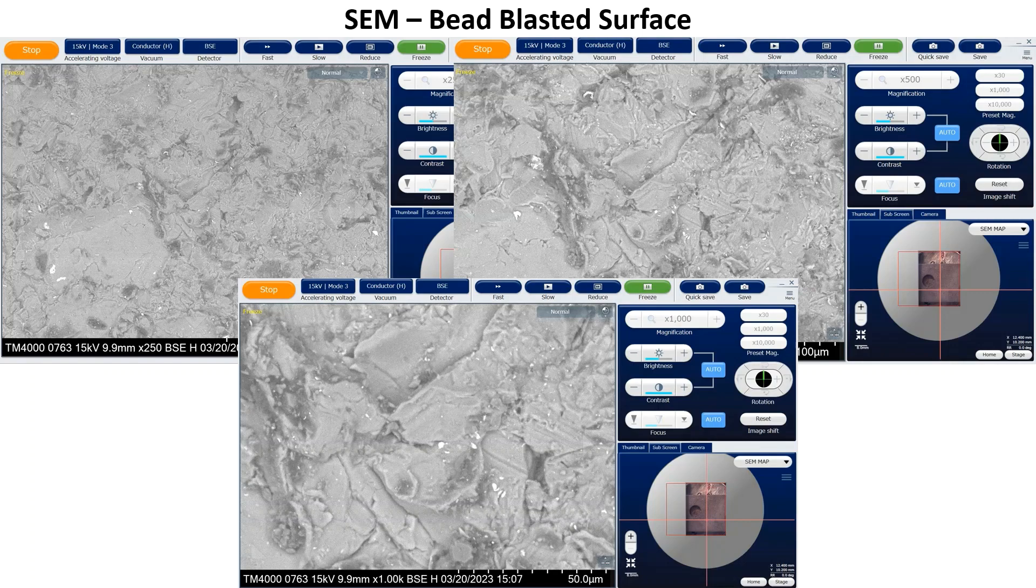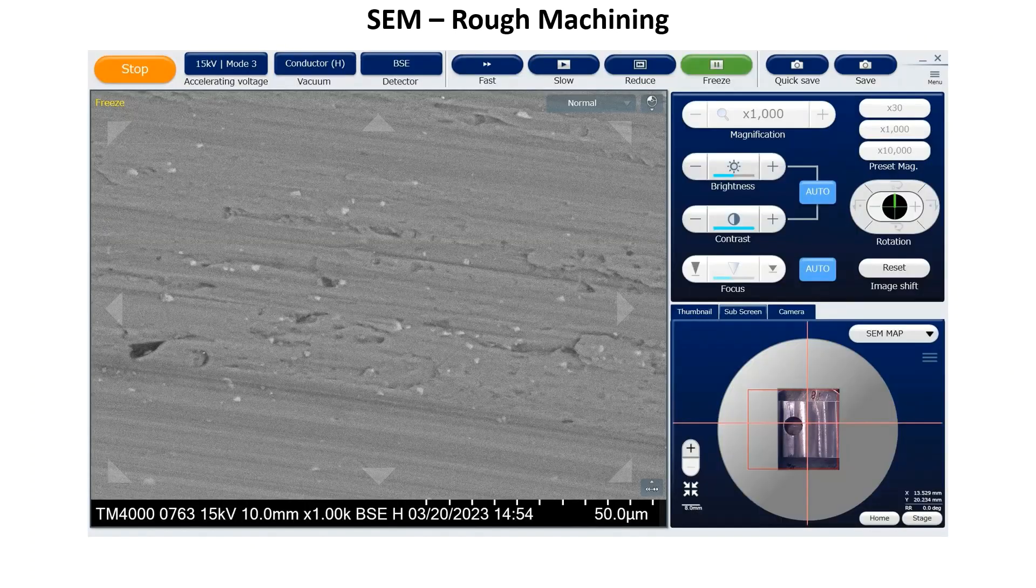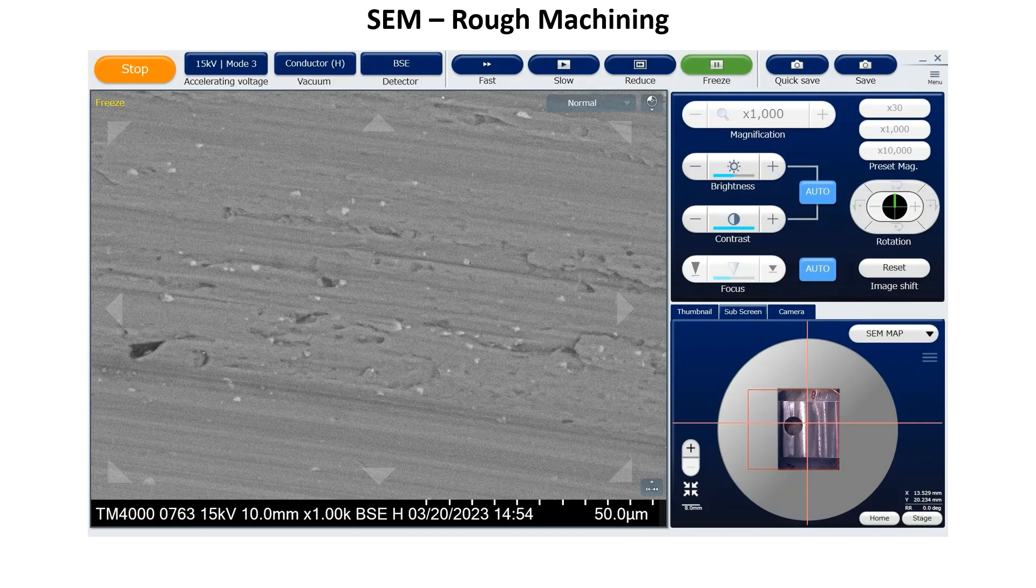This is the bead blasted surface at 250 times magnification in the top left, 500 times on the top right, and a thousand times magnification on the bottom. I was pretty surprised with the roughness and topography of it once I zoomed in. It is even more striking when compared to some of the other surface finishes. This is the rough machined surface at a thousand times magnification. I cut fast with a pretty dull four flute three-eighths inch end mill.